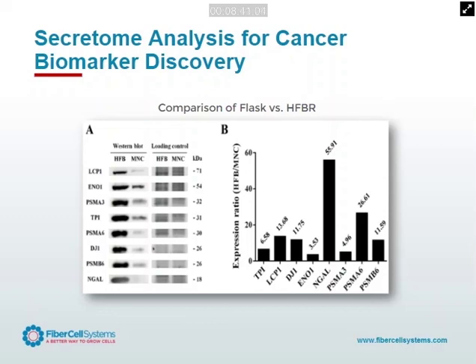This is culturing of primary cholangiocarcinoma cells in the hollow fiber bioreactor utilizing CDMHD versus the cells being grown in flask culture. What they're doing is they're looking to define a biomarker for this specific cancer that they can use for diagnostics of cholangiocarcinoma. So what we see in B is the main piece of data we want to look at.